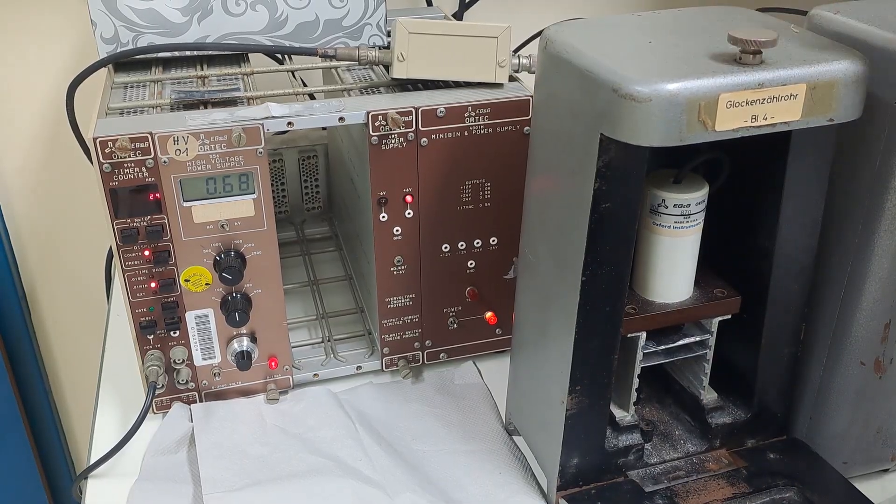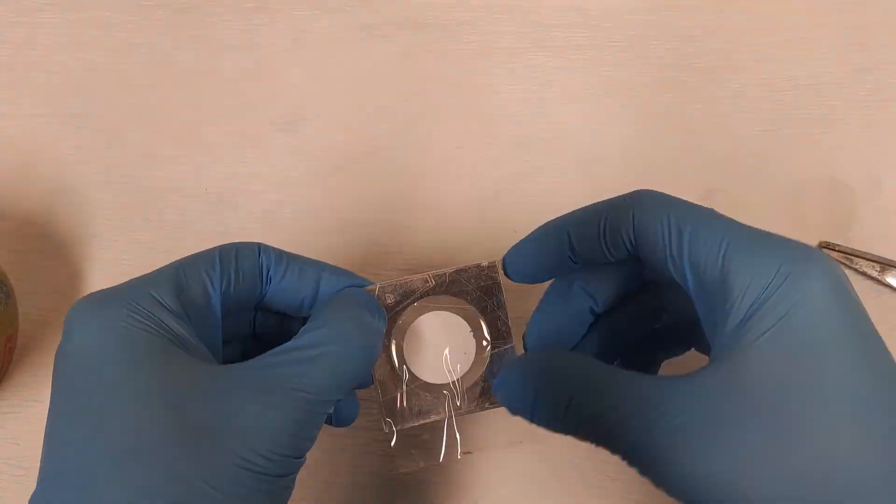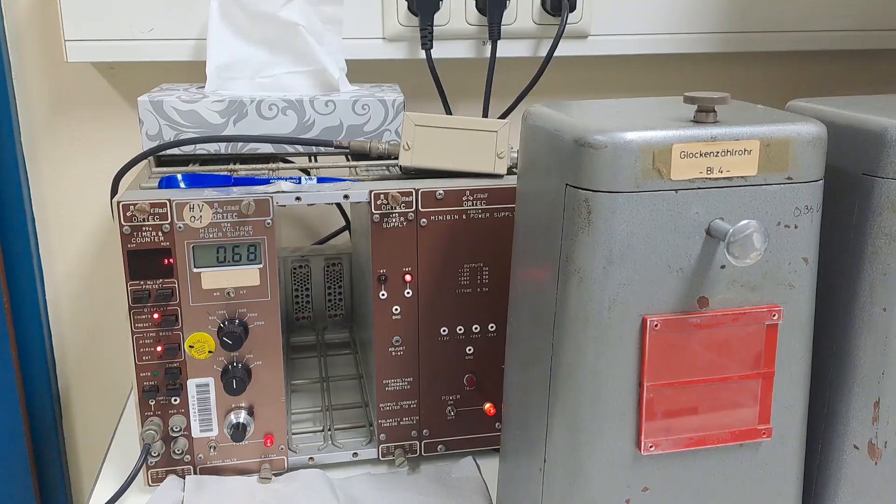And finally, cover the sample with another layer of adhesive tape and measure again. Now this sample is considered a closed source, making the disposal much easier.